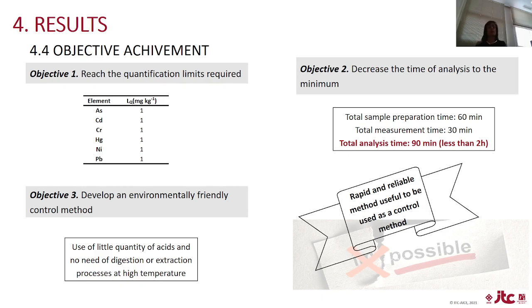And the third objective was to develop an environmentally friendly method, and we use a minimum quantity of acids and no high temperature. So we finally reached the 3 objectives. We have a rapid and reliable method to be used as a control method.